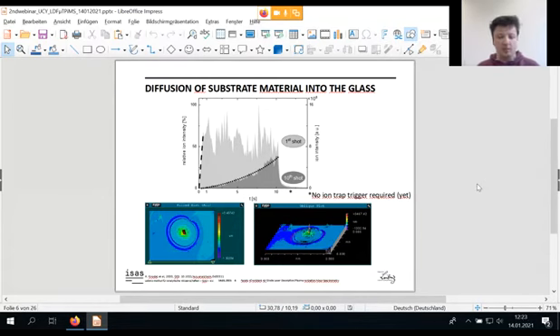That must mean that there is still some copper which heats the surface and then desorbs the analyte, because without heat you cannot desorb something. The desorption process is completely based on heat. It's just a matter of how fast you get the heat into the surface and how hot the surface is, basically, so the surface temperature.